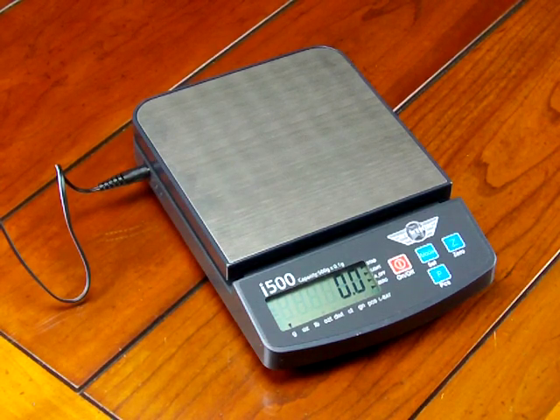In this video, we'd like to show you how to calibrate the MyWay i500 scale. This is an extremely popular scale because it's extremely affordable. It's a great little scale, and we're going to show you how to do the calibration.